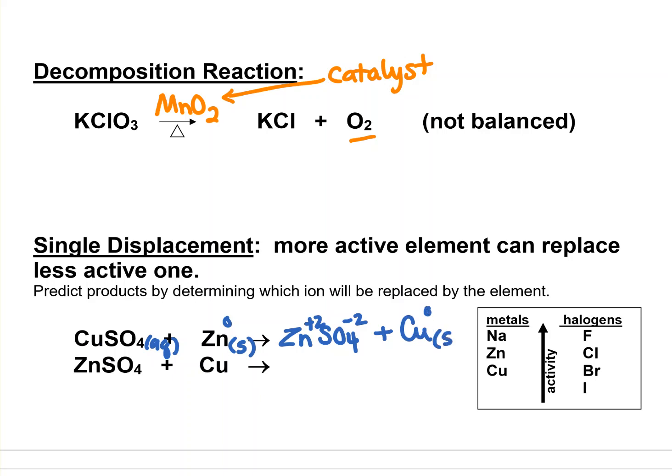And I'm going to tell you, it is a solid. It's sometimes hard to observe that solid, but it is a solid there. If you let this react for a while, you will see these gold little flakes or copper colored little flakes, maybe orange, floating on the top, the surface. And if they float there and you look carefully, they're shiny orange and they're kind of cute. But anyway, so there's that reaction.